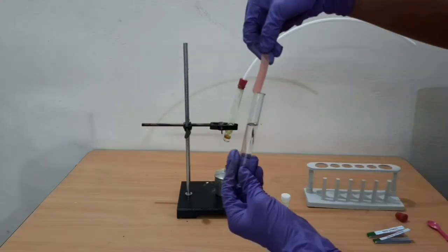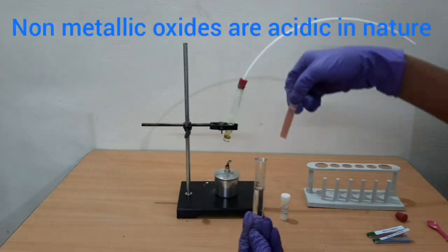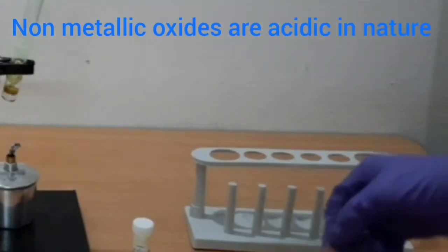There's no change in color with red litmus paper. So we see that the non-metallic oxides are acidic in nature.